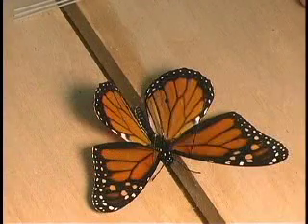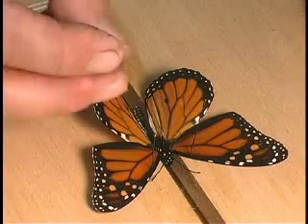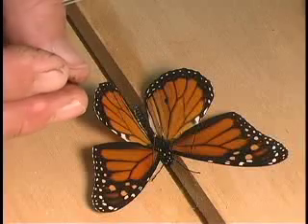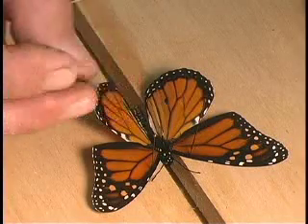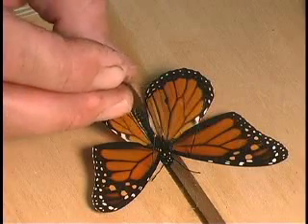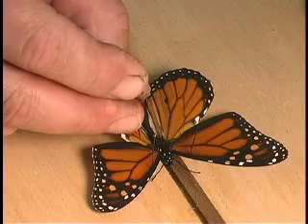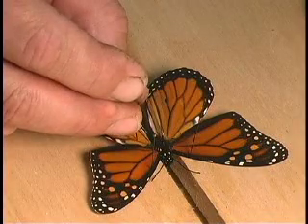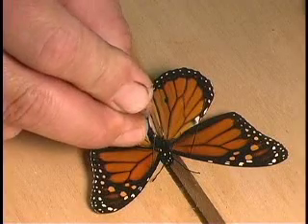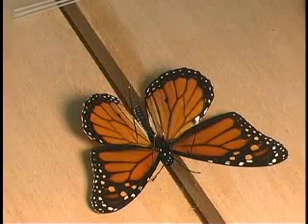Once you've accomplished that, then you can look at the apex of the hind wing close to the upper margin, and you also will see some veins. Make sure that when you insert the pin through the wing, it's behind one of those veins. That will keep you from tearing the wing when you pull it forward or position it forward. Move it only slightly forward.